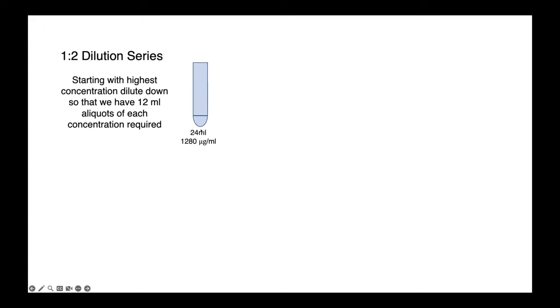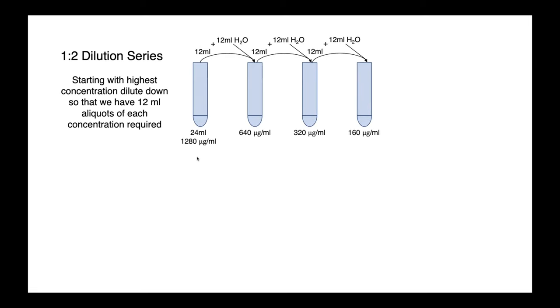So here we have our suspension of our drug and what we need to do is make one in two dilutions of this to give us our dilution series of antibiotics that we're ultimately going to have in plates. So we're going to take 12 mils, combine that with 12 mils of sterile water for a final concentration of 640 micrograms per milliliter, and then repeat this as many times as necessary to give us the concentration range we want in our experiment.